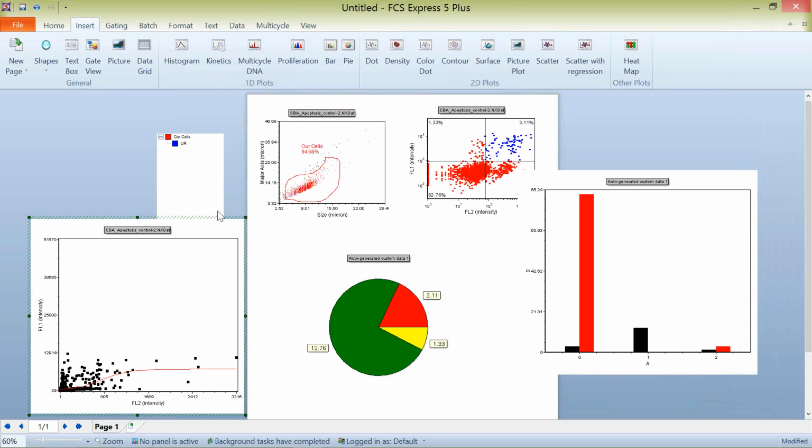So again, these are getting into some of the more advanced features, but I think it's something that everybody should know is now in the toolbox that works very much like Excel. So if there's any of these kind of linearity type assays that people are doing, you can either try and work on it yourself with them, or you could just know that it's there and forward them on to the team on our side, and we can help them out with that.